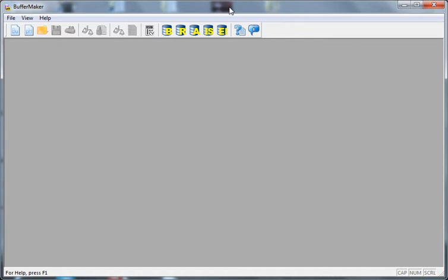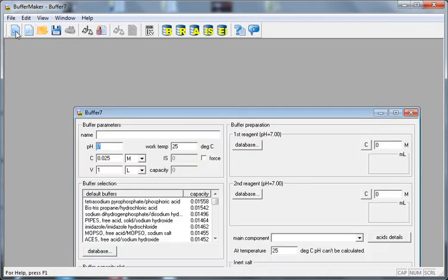This kind of buffer is never easy to calculate, and in this case it is best to use dedicated software. Kemba the Buffer Maker was designed just for this kind of calculation.